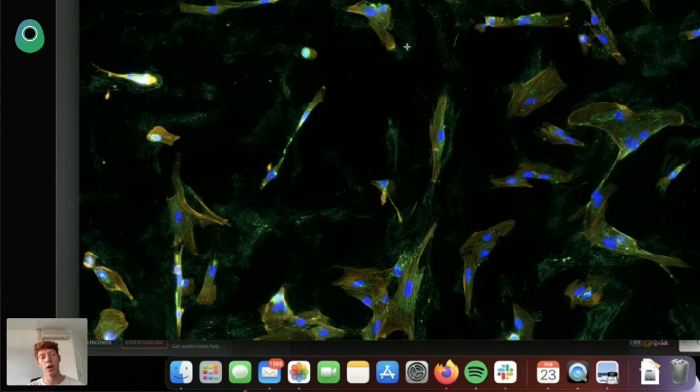To give a bit more context about the use case, they have some microscope and they are studying the propagation of some cells, so cancerous cells, and how some other cells that are natively in our body, called fibroblasts, are helping those cancerous cells to propagate. To measure the propagation, what one scientist can measure today without the help of AI is the global fluorescence. By activating some enzymes in the cells, they can monitor the global fluorescence of one image. But this fluorescence must be reported to the number of cells in the photo in order to have significant results, of course.